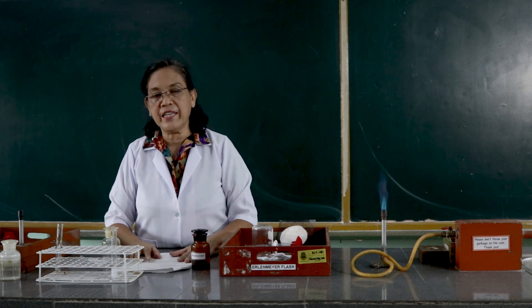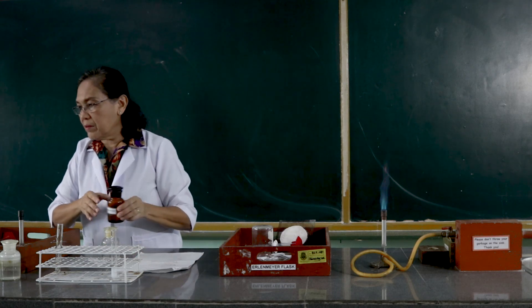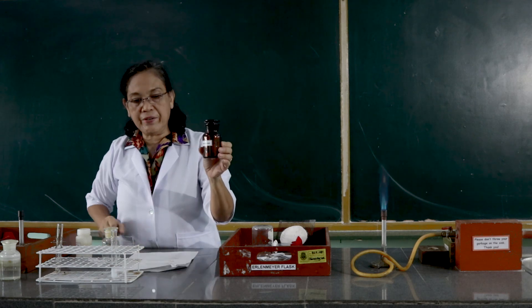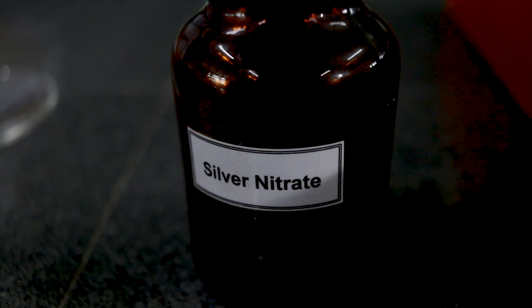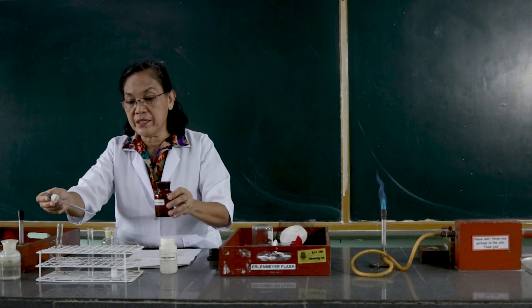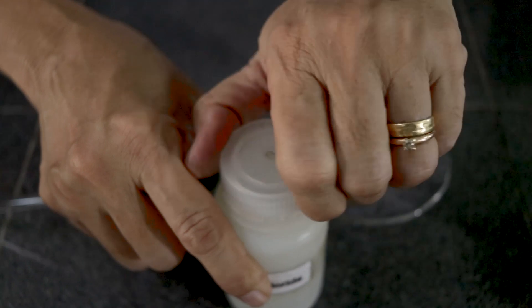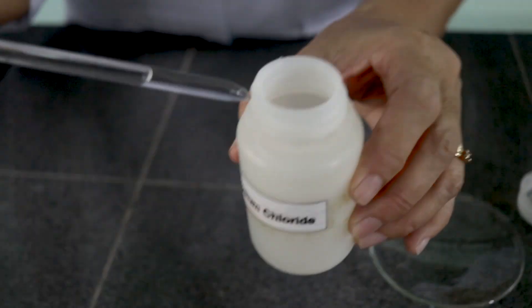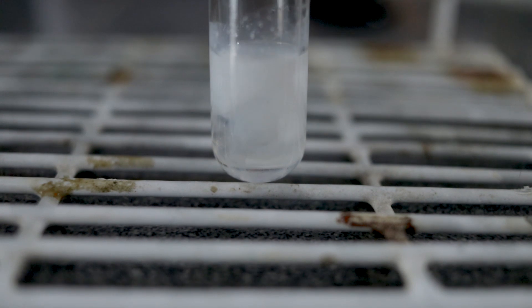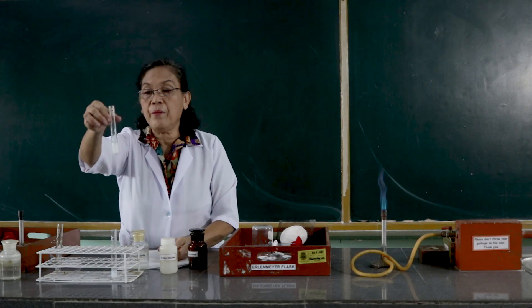Another chemical reaction exhibiting double decomposition is that between silver nitrate and sodium chloride. This is the silver nitrate solution and this is the sodium chloride solution. We will use 3 ml of the silver nitrate and add 3 ml of the sodium chloride solution. I want you to observe what happens.